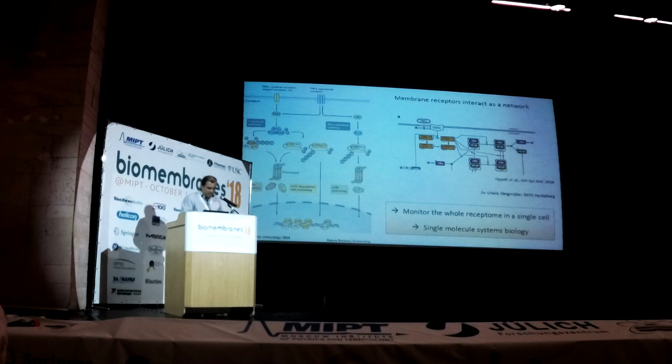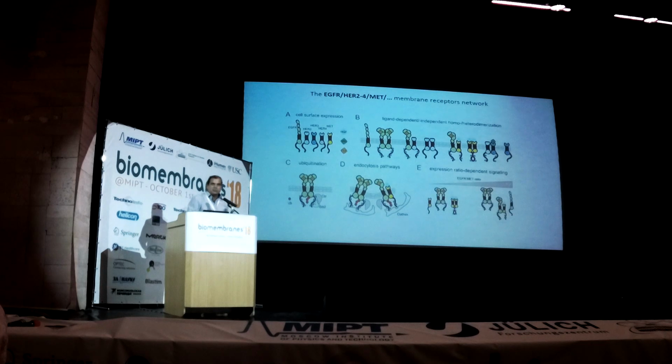And why do I want to use it as a transition slide? Because, well, some 2-3 years ago, we have started with this network of proteins. It's a family together with an associated protein: the EGFR family, which is EGFR and the 3 proteins HER2 to 4. And the associated receptor is the MET receptor. You could extend that, but we've initially restricted to these 5.